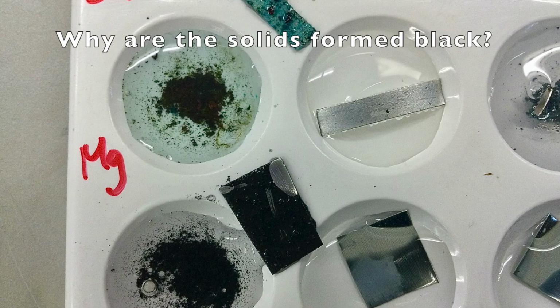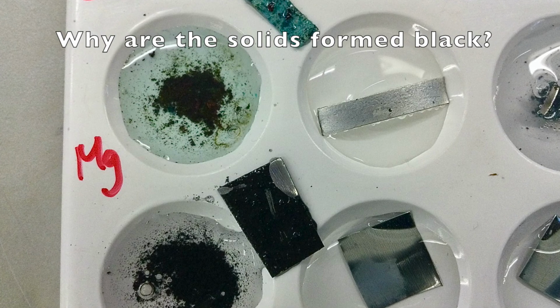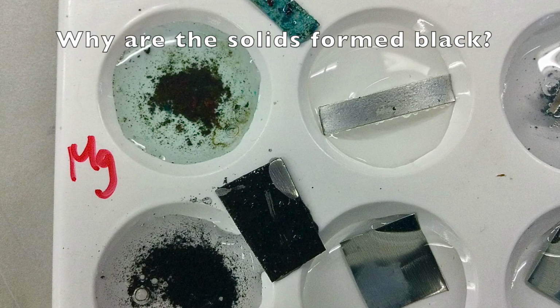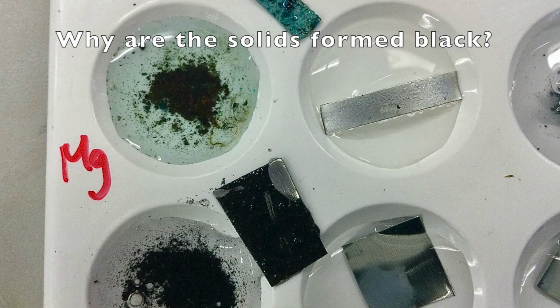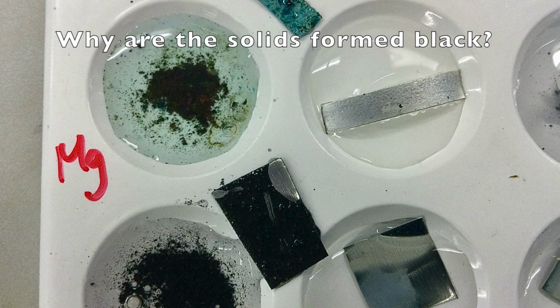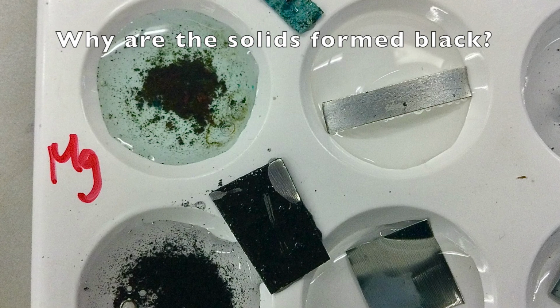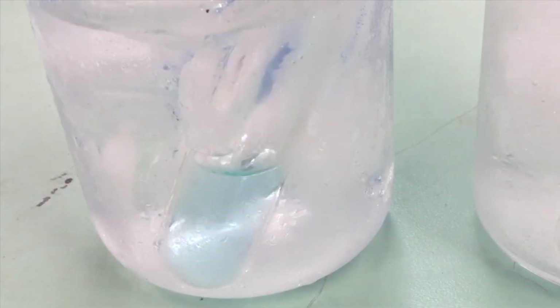The displacement reactions are producing metals as one of the products, and metals are supposed to be silvery, or at least not black. But why is black solid formed? This is probably because the metal so formed undergoes further reaction with oxygen to give metal oxide. For example, magnesium reacts with copper-2 sulfate solution to give copper metal. Then, copper metal further reacts with oxygen to form black copper-2 oxide. If we carry out the displacement reaction between magnesium and copper-2 sulfate inside an ice water bath, we are able to observe reddish-brown solid of copper.